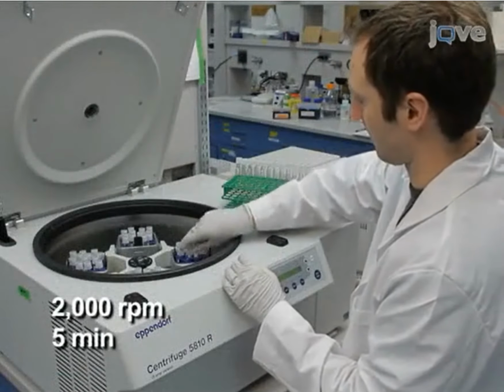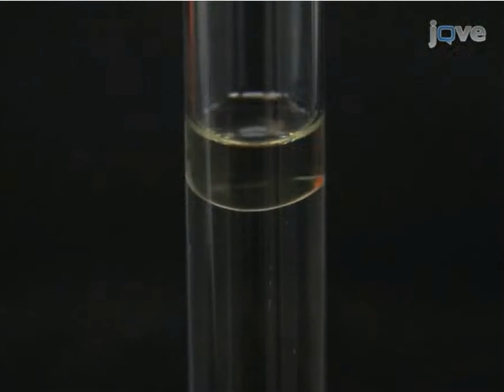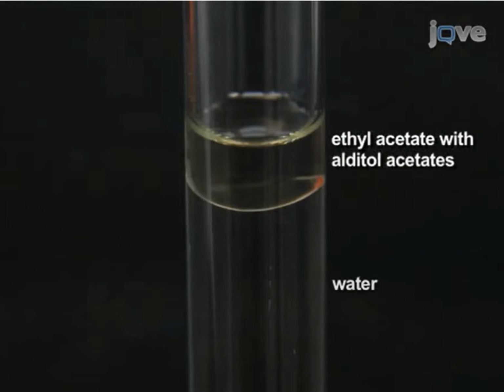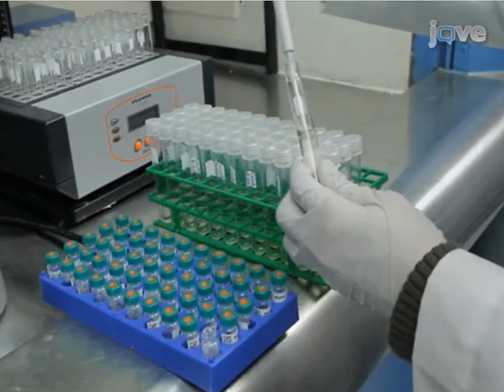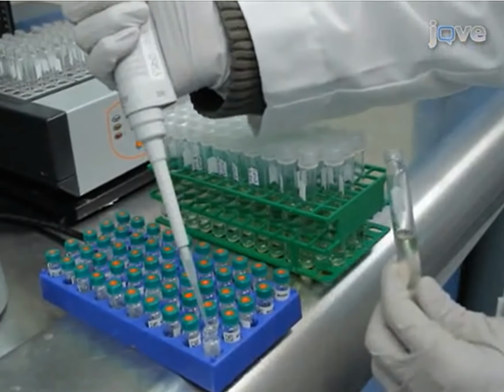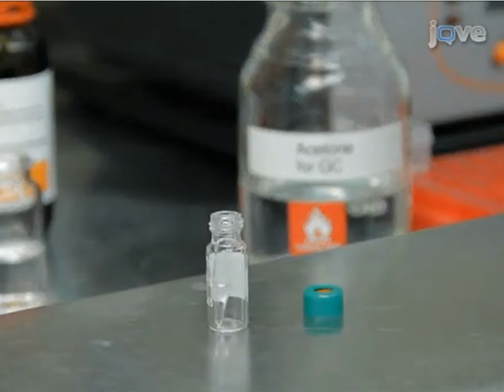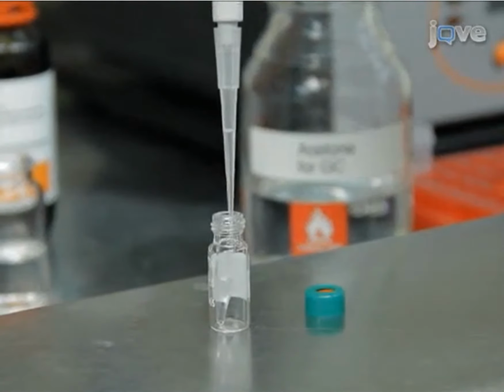Centrifuge the tubes at 2000 RPM for 5 minutes to obtain clear separate layers with ethyl acetate on top, containing the alditol acetates, and water on bottom. Pipette 50 microliters of ethyl acetate layer into GCMS vials with inserts. Dilute by adding 100 microliters of acetone to the GC vial and cap.